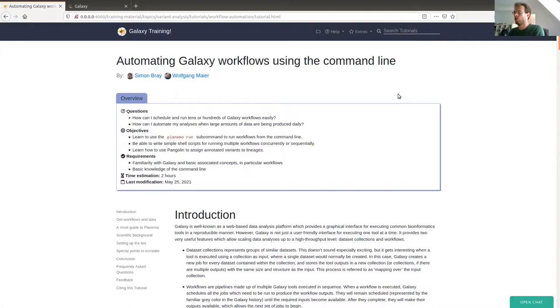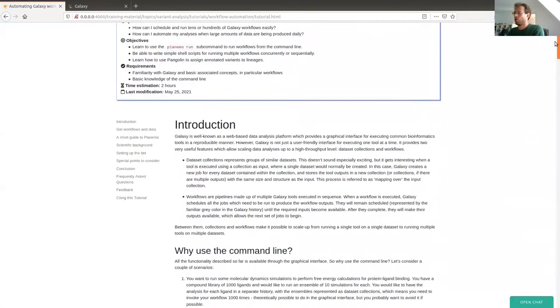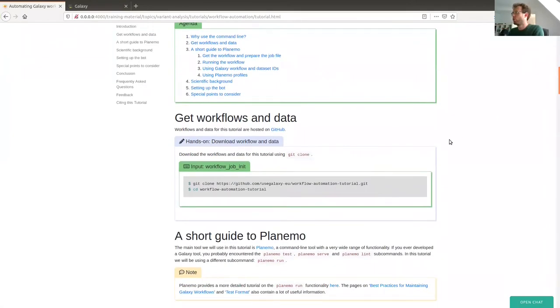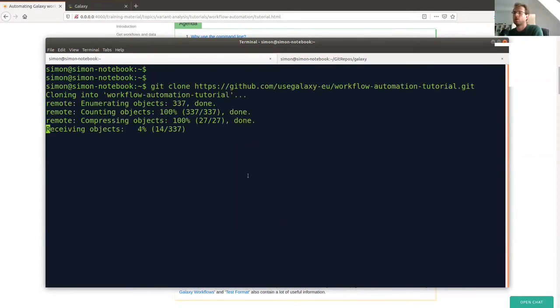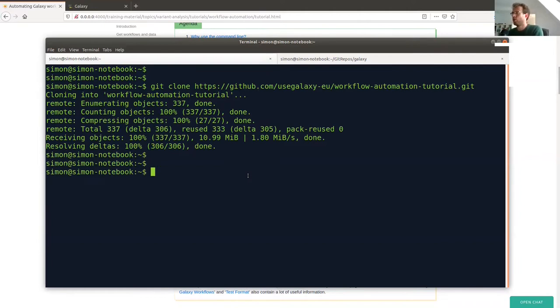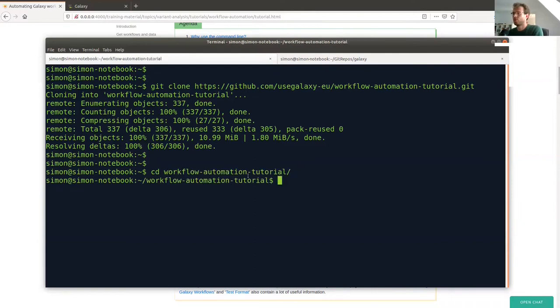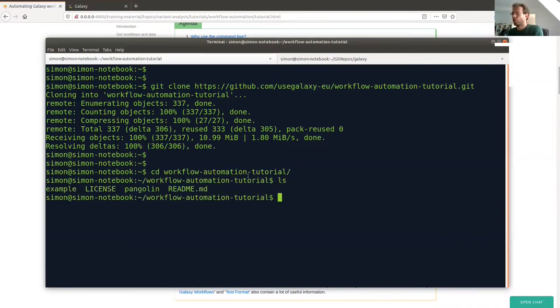Let me give you a brief demonstration of some of the features Planemo has to offer for running workflows. The first step is to download the workflows and data we'll use during this tutorial — we provide them in a GitHub repository. You can get them by running the git clone command provided. I'll copy this link into my terminal and paste it. Then I can cd into the repository. You'll see there are two subdirectories: the example subdirectory and the Pangolin subdirectory, which contains the scientific workflow we'll work with later on.